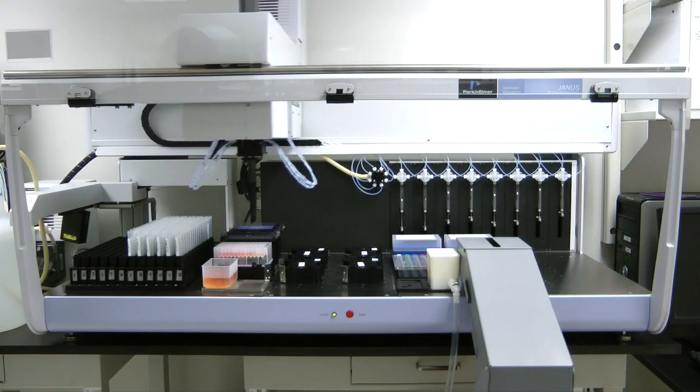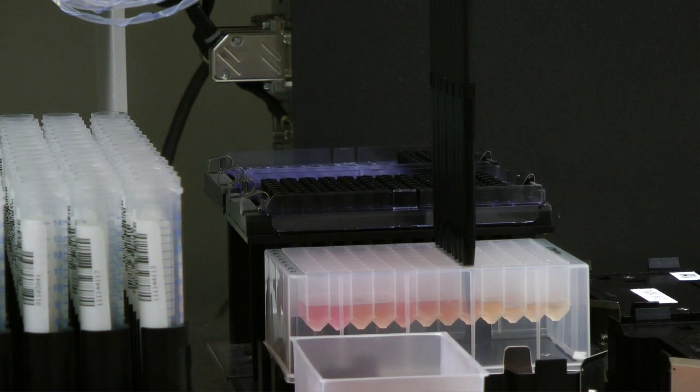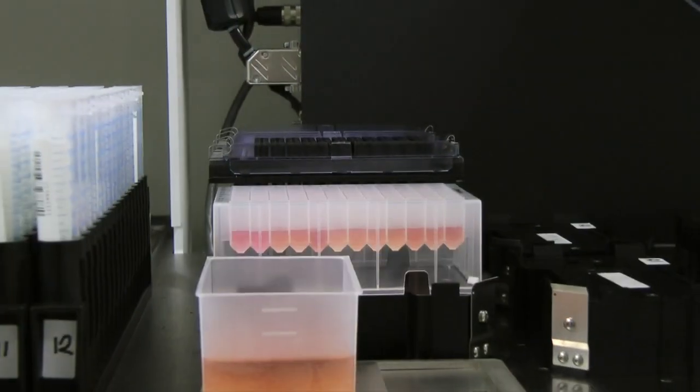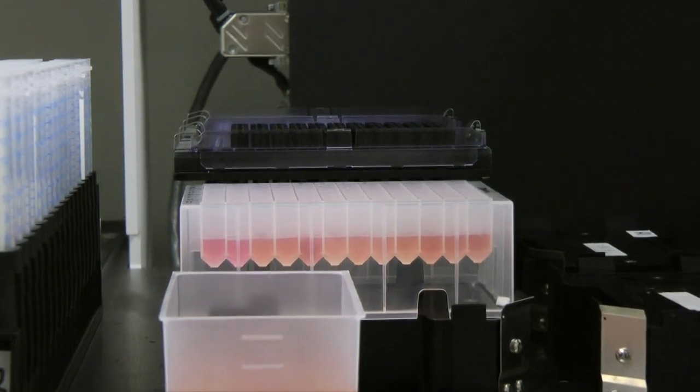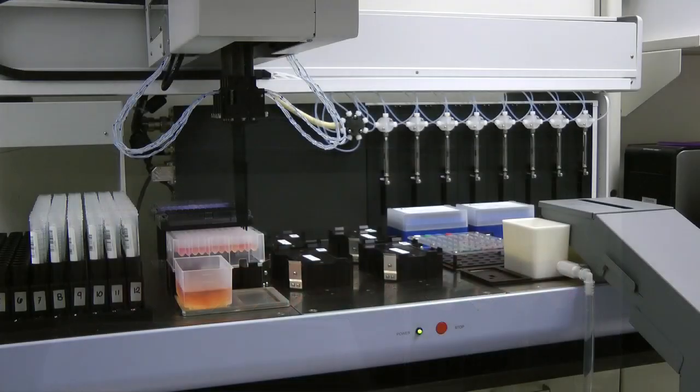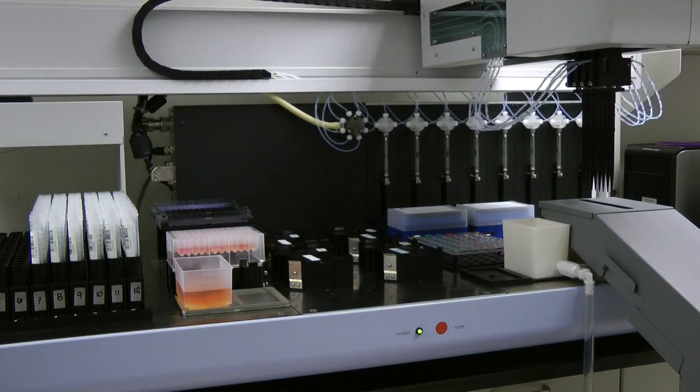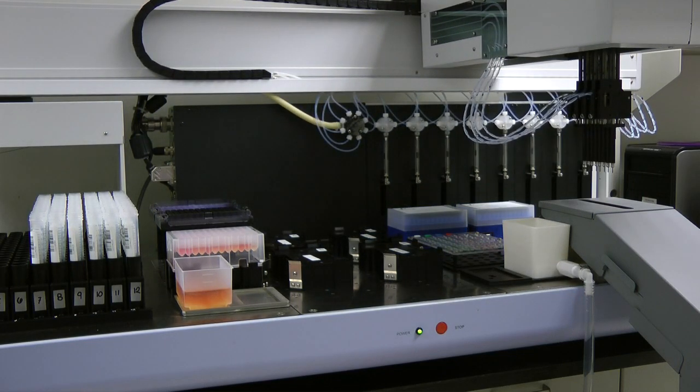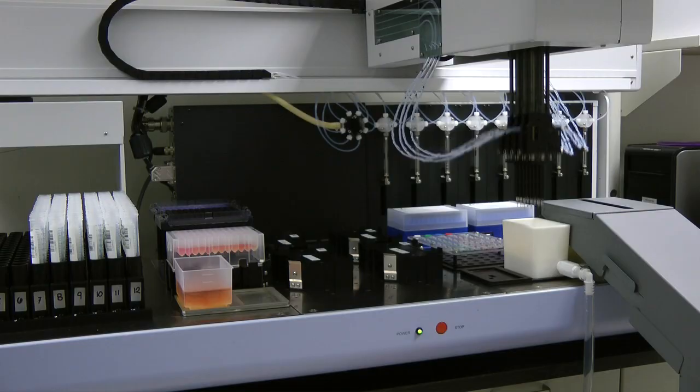and dispense PBMCs for each sample into its corresponding position in the deep well plate. The dilutions are now complete and each sample has now been standardized to 2.5 million PBMCs per milliliter. The Janus completes 96 cell dilutions in a matter of minutes. The final cell suspensions are ready for plating.